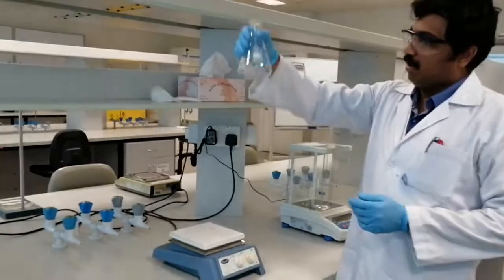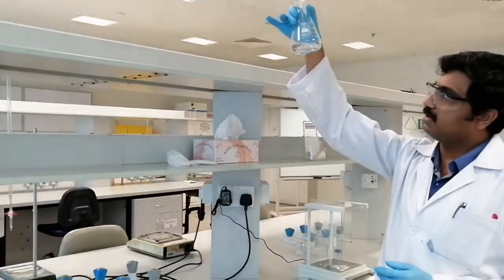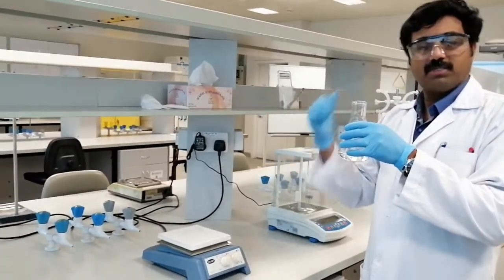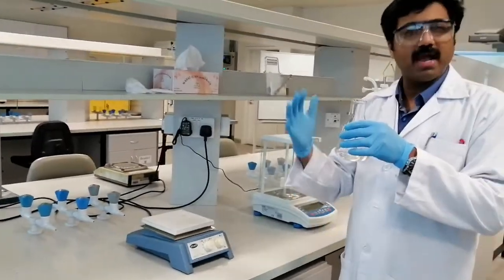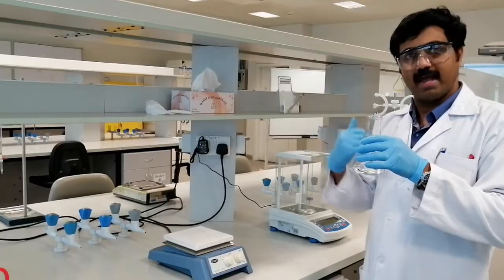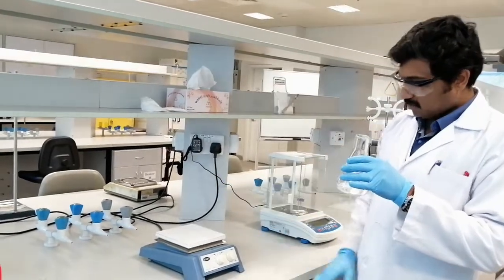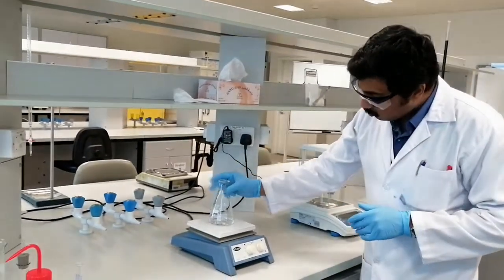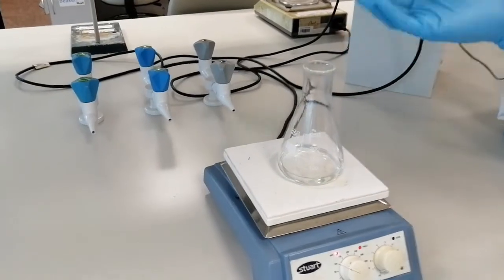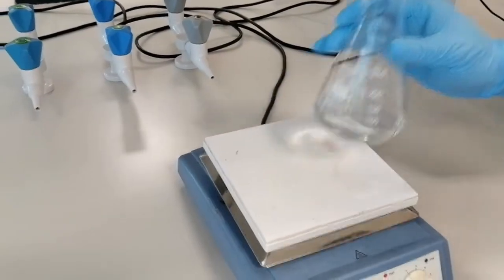All the crystals are now dissolved, giving a clear solution of oxalic acid in aqueous sulfuric acid. Before starting the titration, remember that the reaction between potassium permanganate and oxalic acid is very slow at room temperature. To increase the speed of the reaction, we need to warm the oxalic acid mixture on the hot plate. The solution is now warm — I can see fumes coming from the mouth of the flask, so I'll take it off the hot plate.